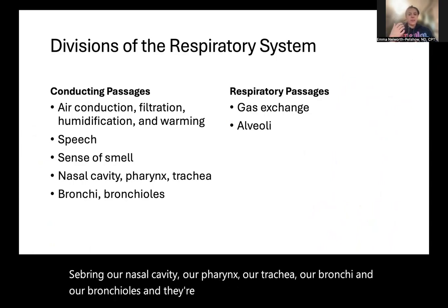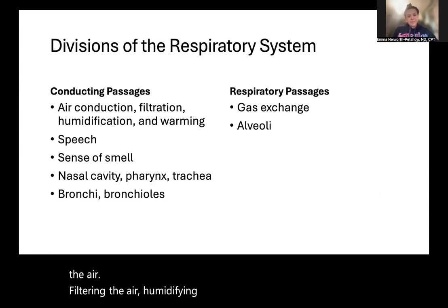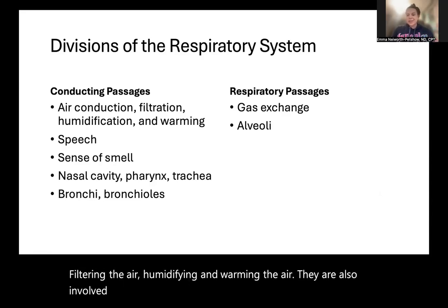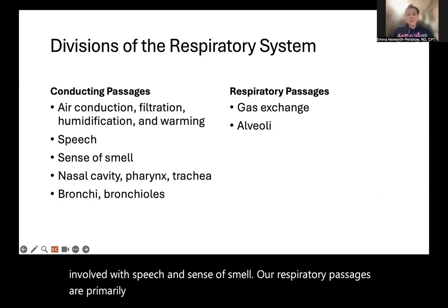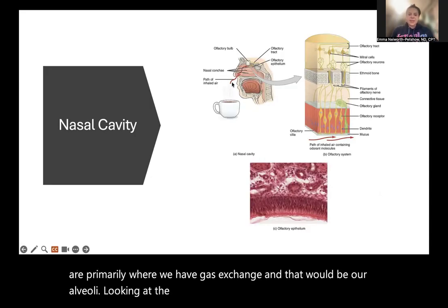They're involved with conducting or moving the air, filtering the air, humidifying, and warming the air. They're also involved with speech and sense of smell. Our respiratory passages are primarily where we have gas exchange, and that would be our alveoli. Looking at the nasal cavity, we can see some general anatomical structures.